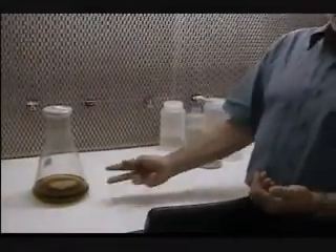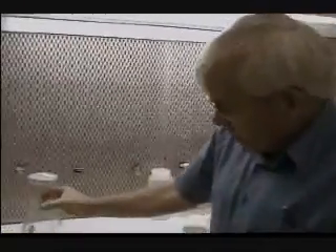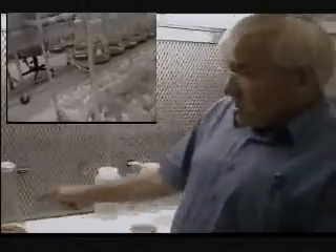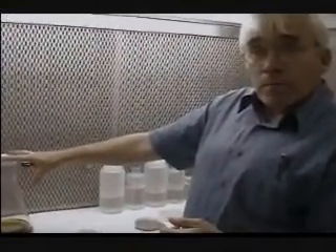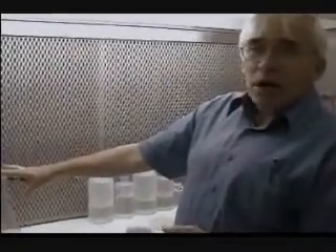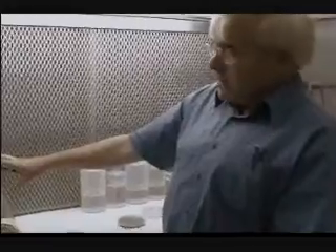What we want to do is get those fungal cultures back onto the appropriate tree species in the field. Once we have a number of these, they grow in an incubator at 25–27 degrees, and I'll show you the lineup of those. North American and South American species grow at roughly the same temperature — 27 is pretty standard. The Chilean species will take a little bit higher, up to 30, but because we grow both together in the incubator, we split the difference so we don't overstress the North American species.